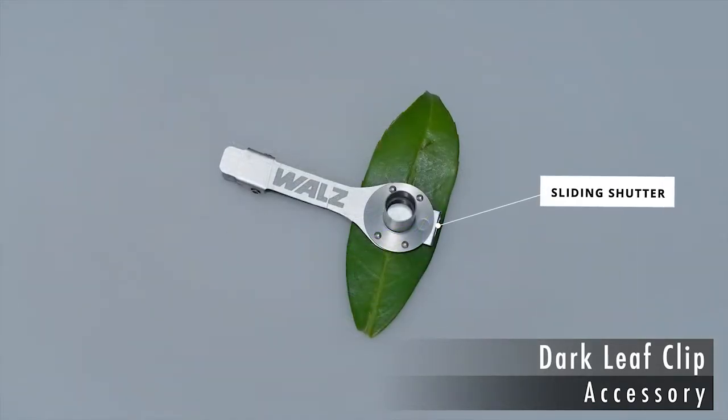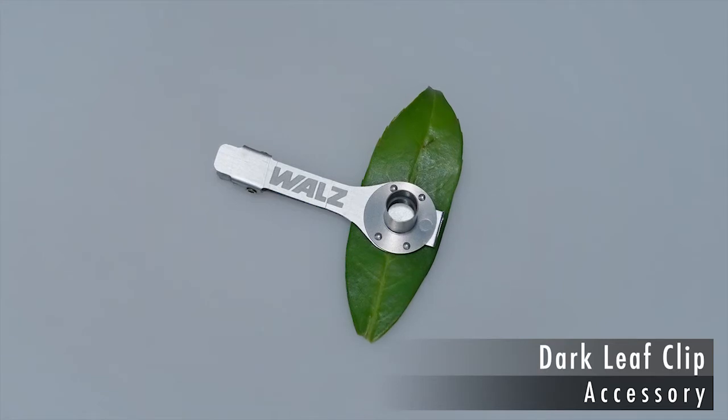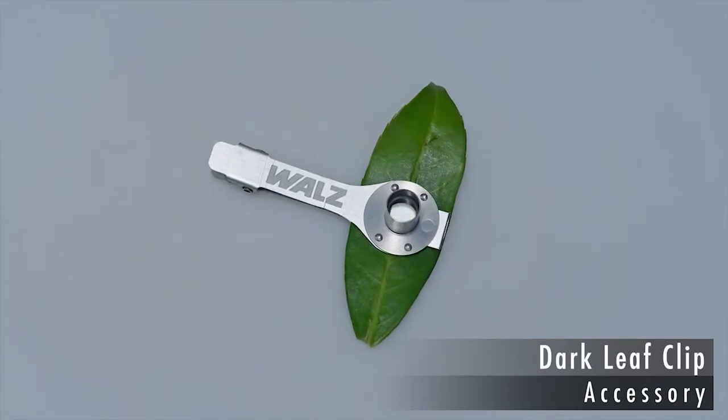With the shutter closed, the fiber optics is inserted into the cylindrical sleeve of the clip. The shutter is then opened in order to measure the FV over FM value.